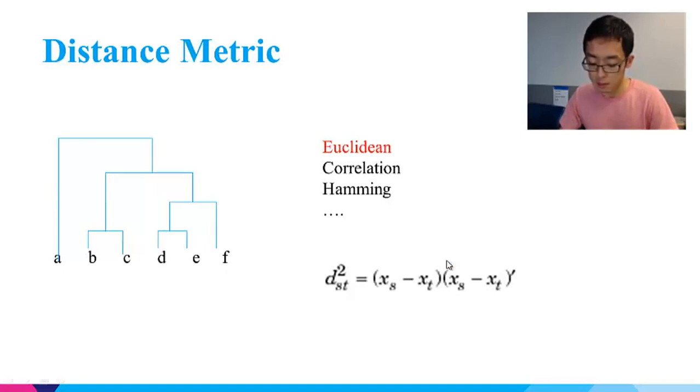Besides Euclidean distance, you can choose cosine distance, correlation distance, Hamming distance, and so on. But most of the time, Euclidean distance will do the job. One special case may be, for example, if your dataset is binary, you may want to use Hamming distance as your metric because it is specially designed for binary data.